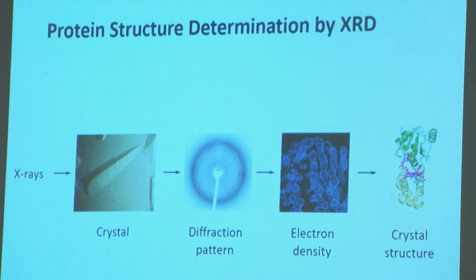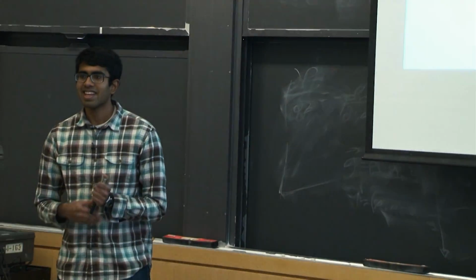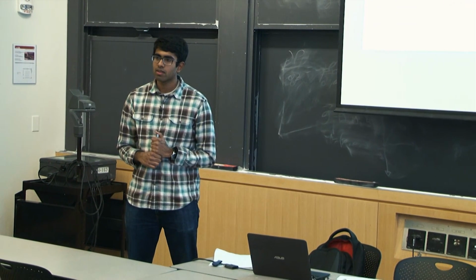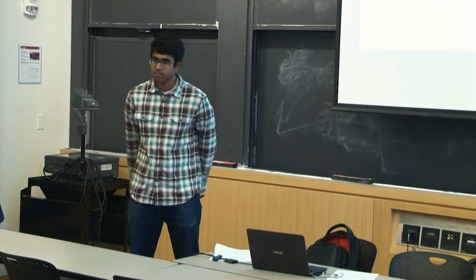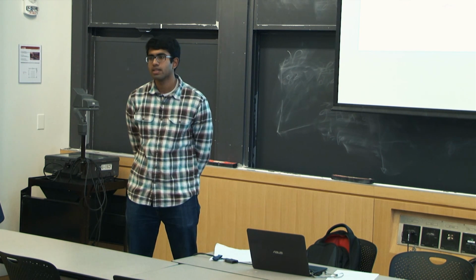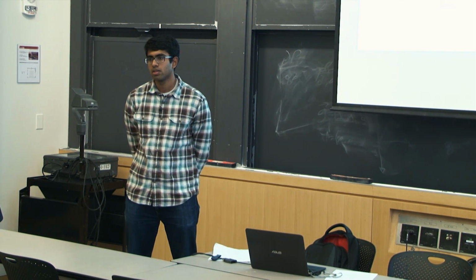I didn't fully understand how, it's probably very complex, but how do you get the electron density from the diffraction pattern? Like in organic chemistry, in basics one, I thought that from a diffraction pattern you can learn the distance between atoms, like the lattice points. But here with proteins, every point is itself a protein, right?